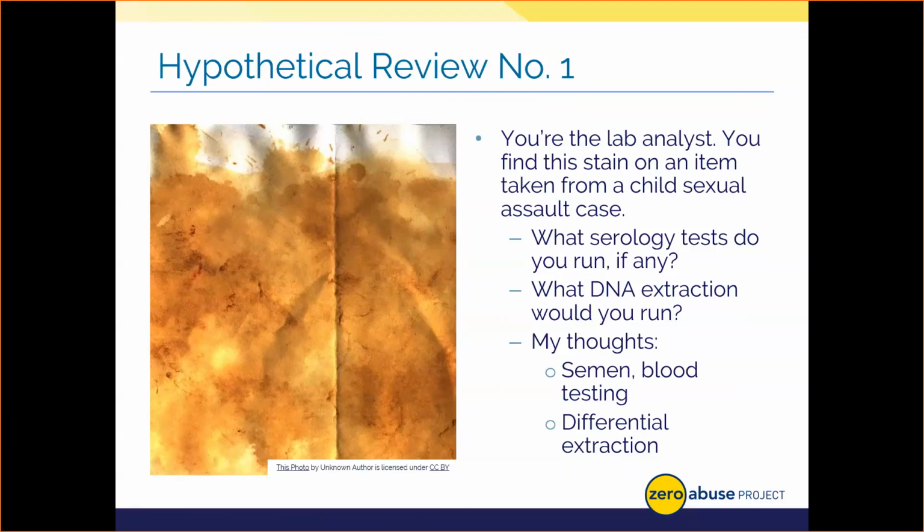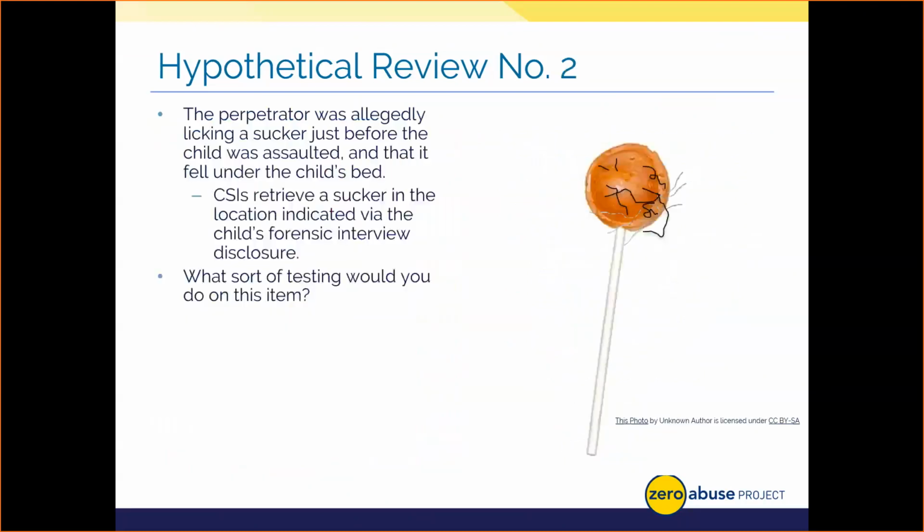Now, in terms of the DNA, I mentioned extraction. We went through that pretty quick, so it's okay if you weren't sure here and I didn't see any responses in the chat. Given that this is a sexual assault and given that I know with differential extraction, I can pull out semen and the victim's potential epithelial cells and create two different profiles, I'd go ahead and do that and try to make it easier on the front end, as opposed to finding out I have a mixture and trying to deconvolute it through back end steps. I think that's just a much more informed way to do this. So good job. Let's go ahead and look at a second hypothetical.